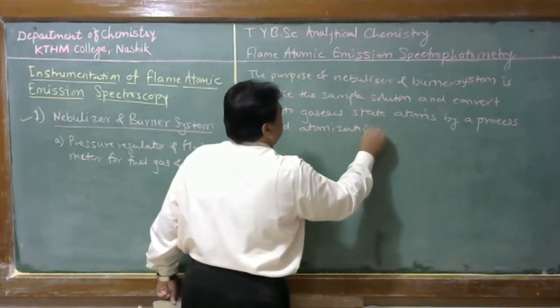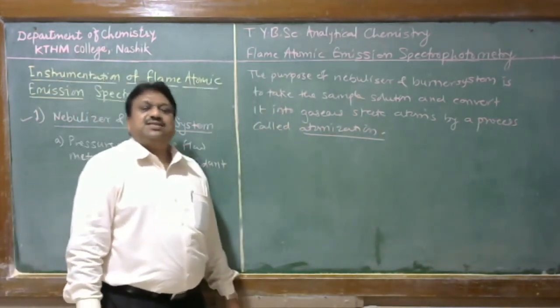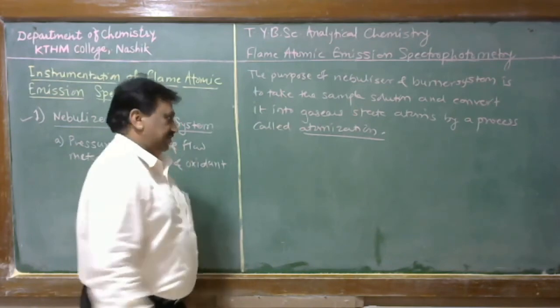That means atomization is a process in which the liquid sample is converted to gas-phase atoms.